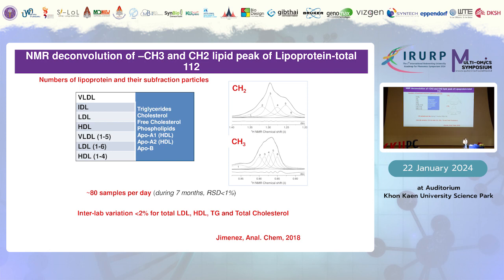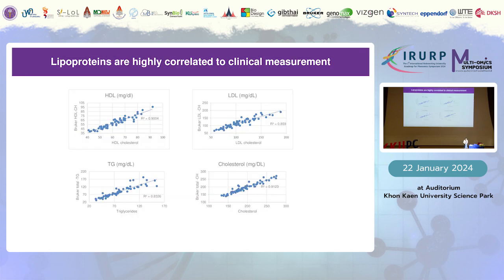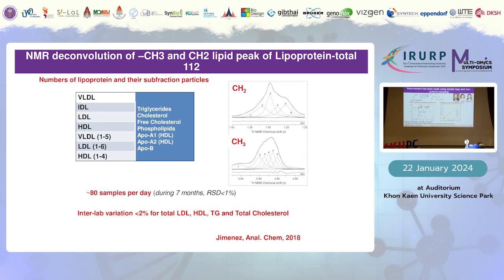in the lipid. For each of these lipoproteins, you could get the different triglycerides, cholesterol, free cholesterol, or different proteins. And you can see if we compare with the clinical measurement, they have a linear correlation. I think this is a very good tool for measuring different lipoproteins.